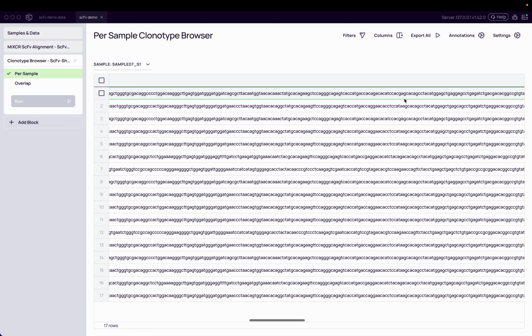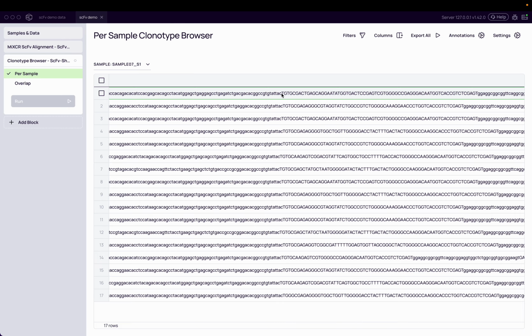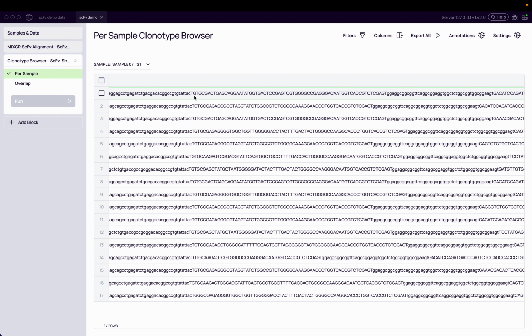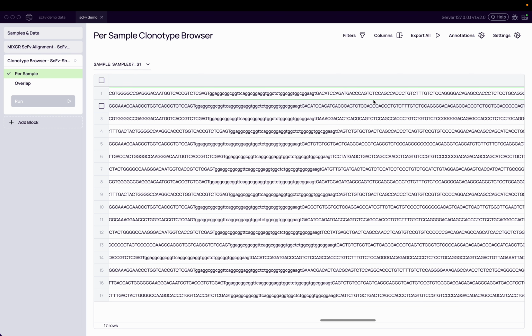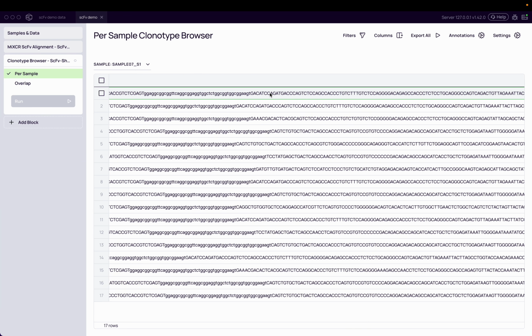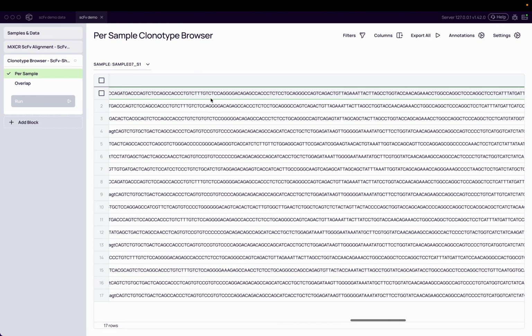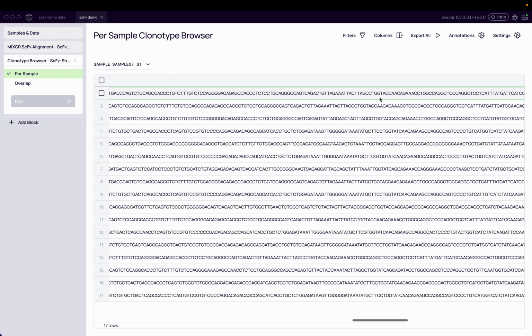If we use the scaffold sequence, then this part will be imputed from our scaffold sequence. And the uppercase letters are the part of the scFv which is covered by our library: the part coming from read one containing the heavy chain, then the linker sequence, and finally the part of our NGS data that covers the light chain. And for the light chain, we see it is fully covered towards the end of framework 4.